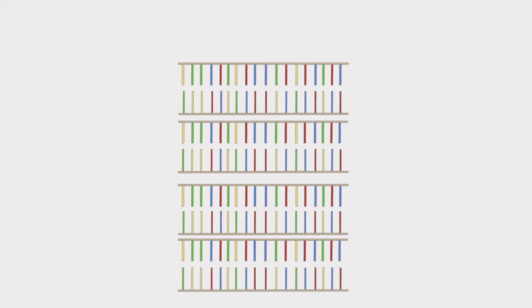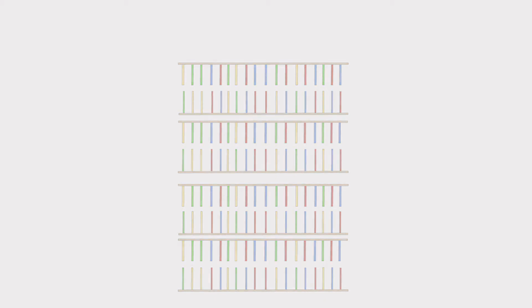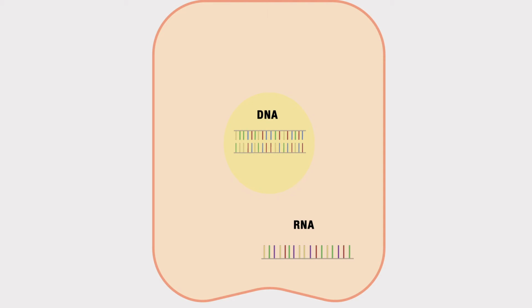In qPCR, we will rely on the same principles of PCR with 2 key differences. First, qPCR relies on an RNA template instead of DNA. And second, instead of analyzing the product after many rounds of amplification, qPCR allows us to monitor the amplification that takes place during each cycle. Now let's go back to our analysis of gene A and talk through the qPCR process.